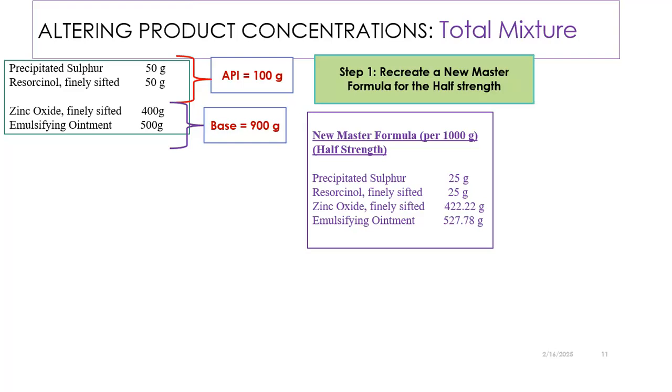Pretty much we've removed 50 grams from the recipe, and so the formula must still add up to 1,000 grams, and so we're easily redistributing the quantities removed from the active towards each of the paste ingredients. And by doing this so skillfully, we would have still maintained our paste dosage form.